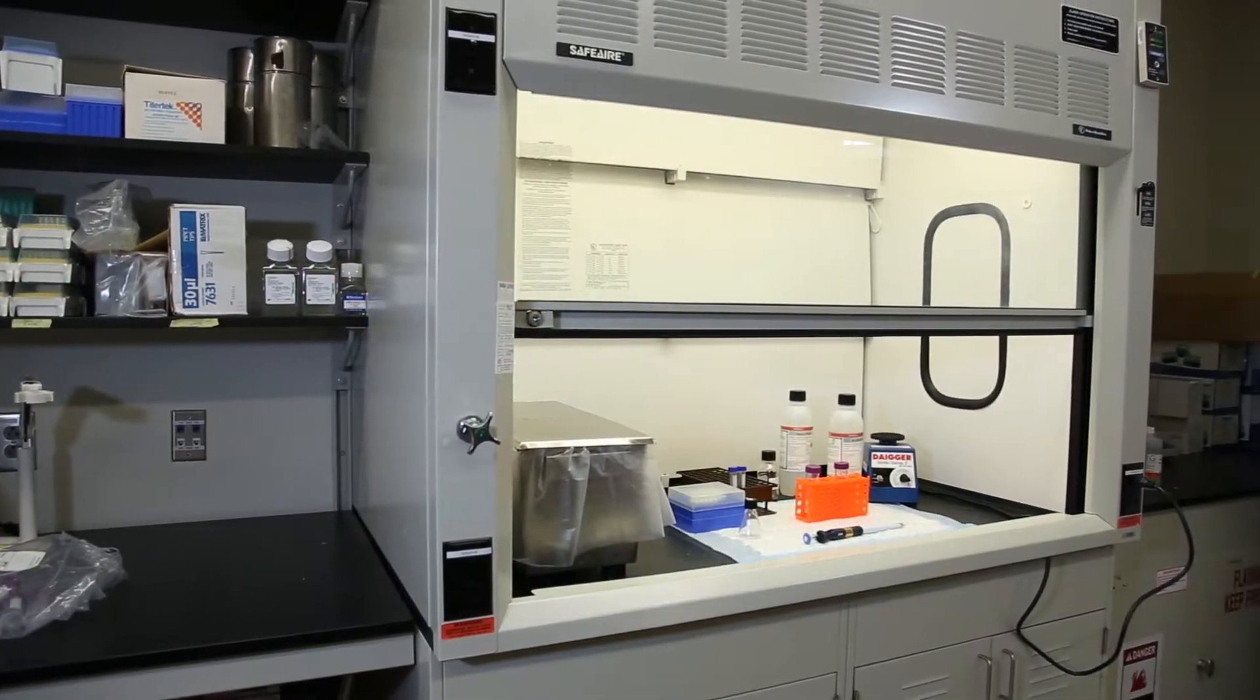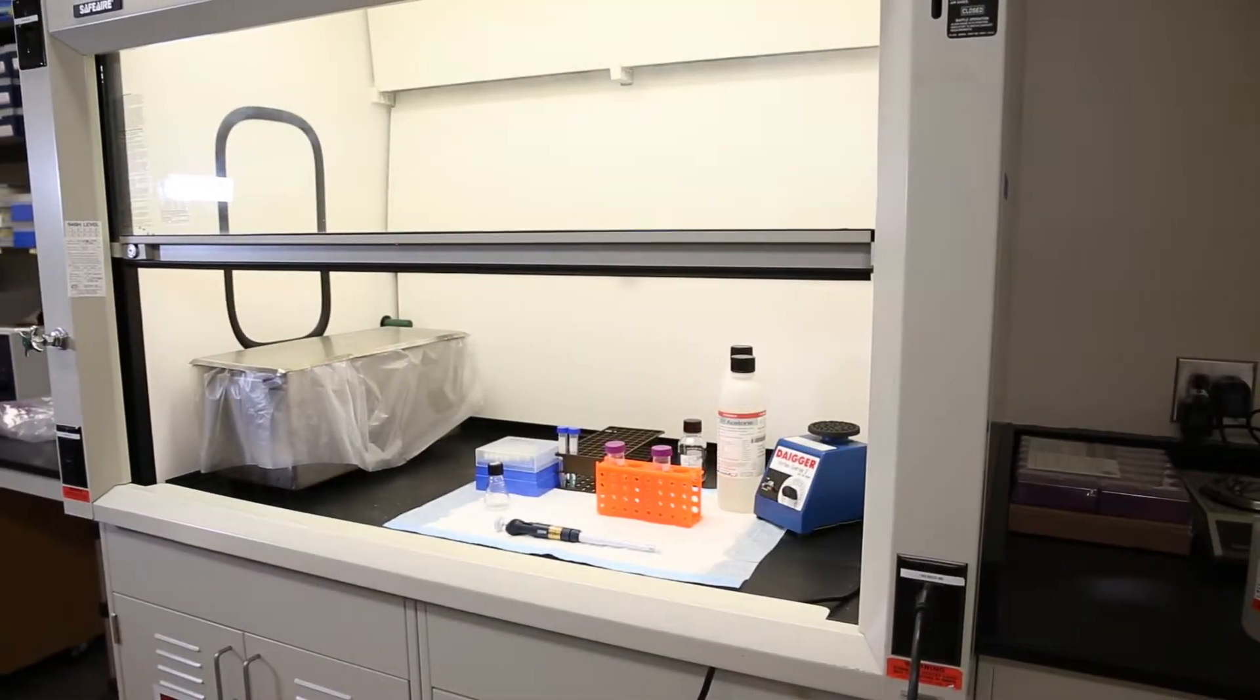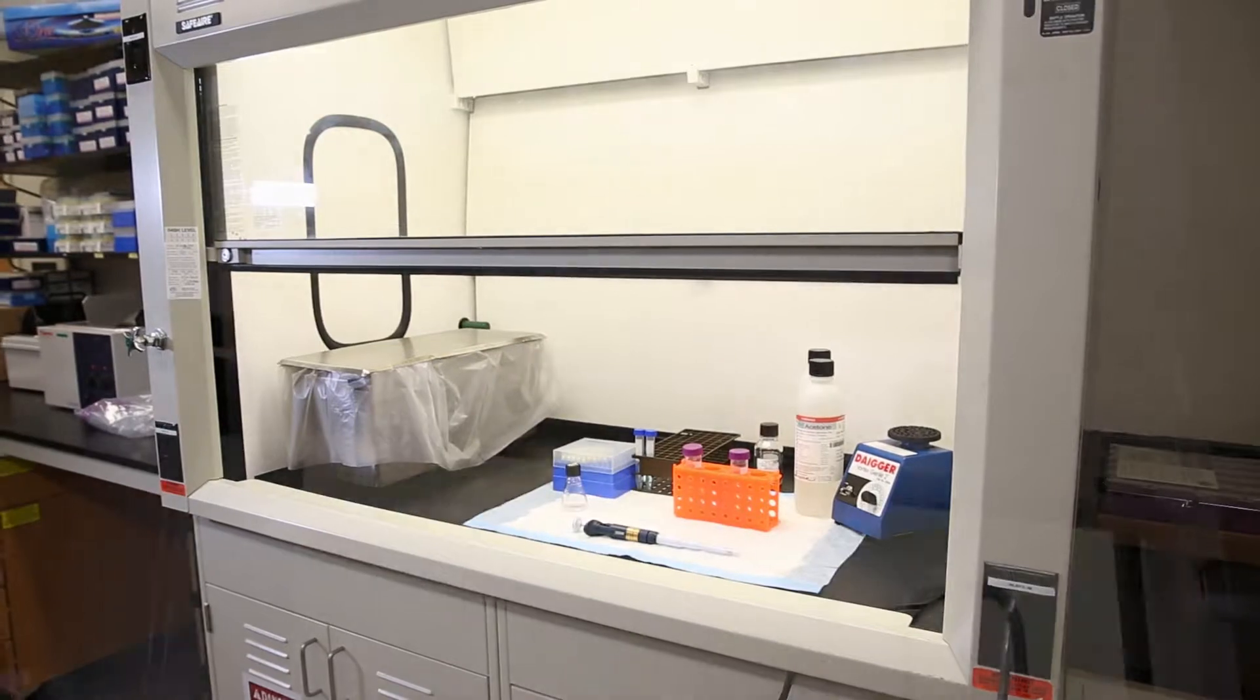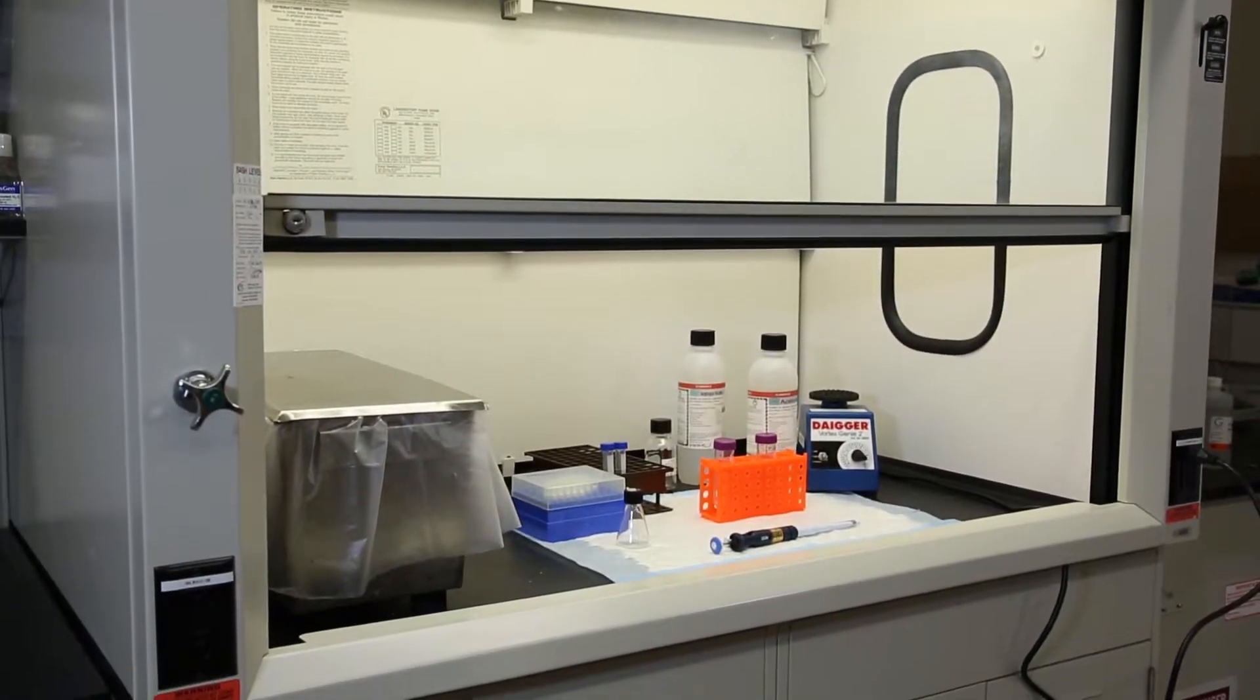There are several types of chemical fume hoods that provide protection and help capture and exhaust chemical vapors and airborne particulates. However, all types work on similar principles.